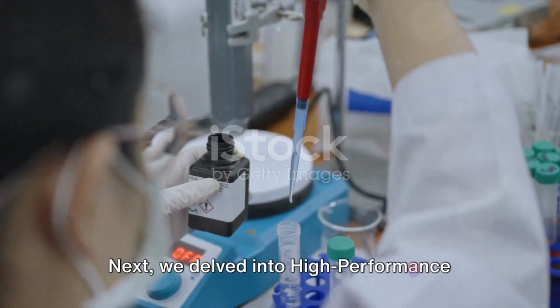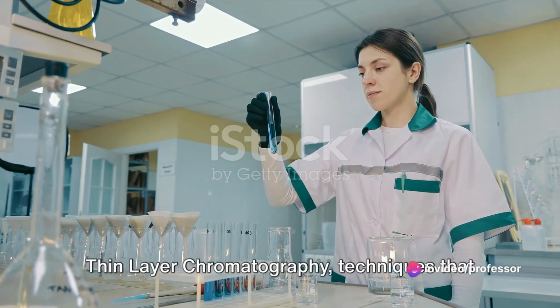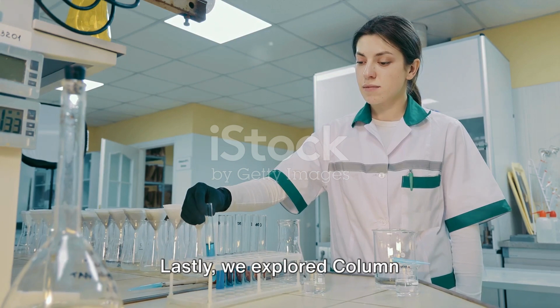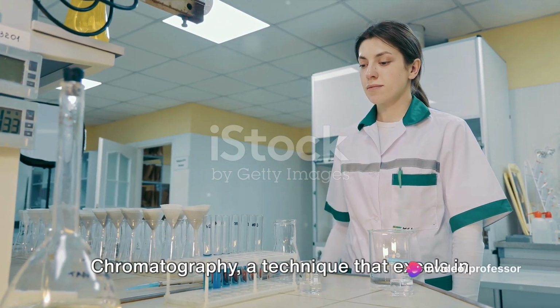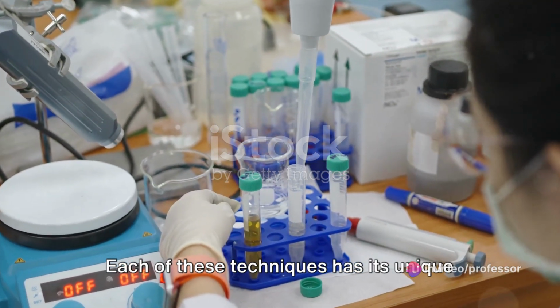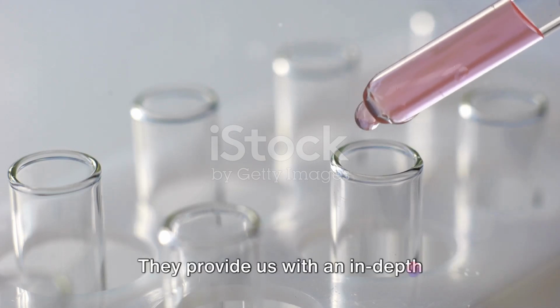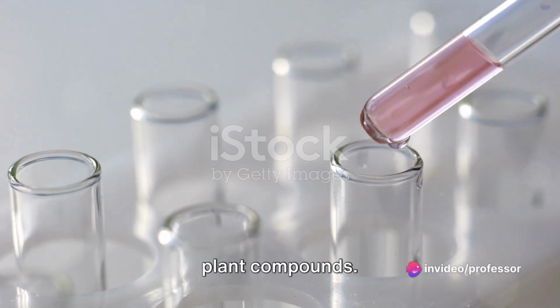Next, we delved into high-performance liquid chromatography and high-performance thin layer chromatography, techniques that offer high resolution and sensitivity, making them ideal for complex analyses. Lastly, we explored column chromatography, a technique that excels in separating compounds from large, complex mixtures. Each of these techniques has its unique strengths, and their applications in analyzing plant-derived products are vast and varied. They provide us with an in-depth understanding of the complex world of plant compounds.